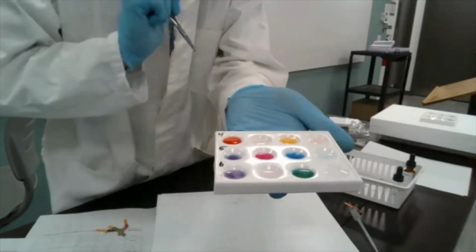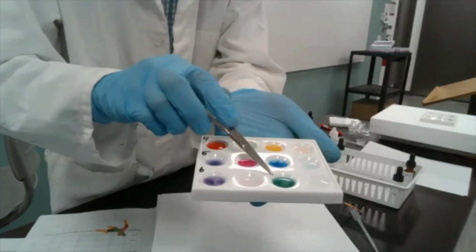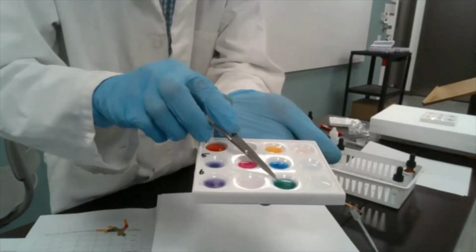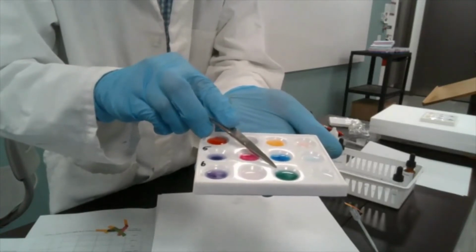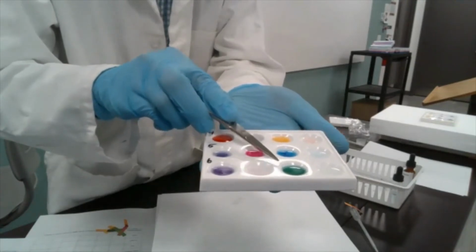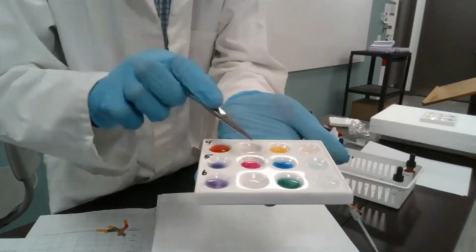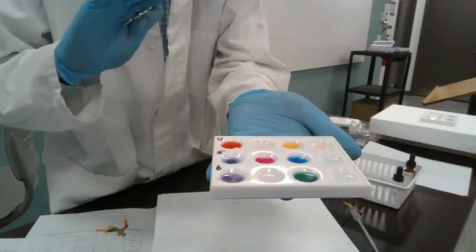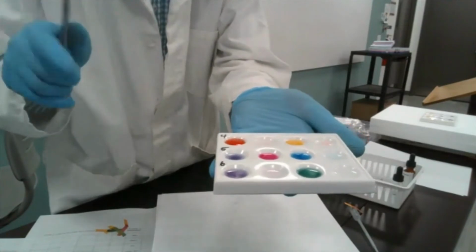That was the glass cleaner. And if we look at our bromothymol blue, you see this is green, right? Does anyone know what color you get if you mix blue and yellow? Like if you worked with paints, you may know. Yeah, you get green. So this indicator, sometimes with indicators is not 100% this or 100% that. Indicator changes color gradually.